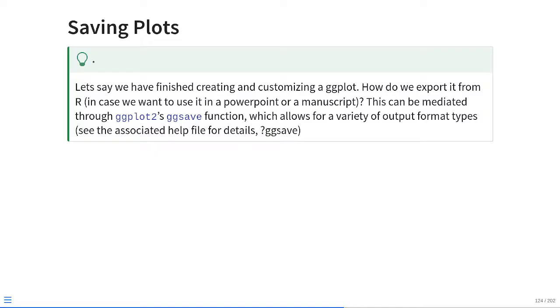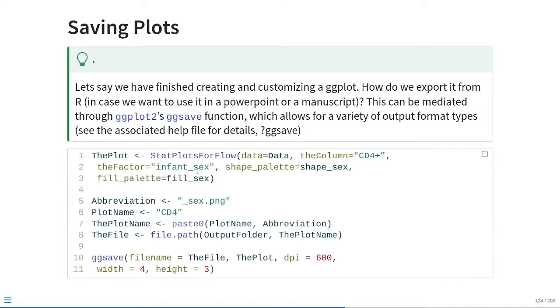And what this is going to look like in actual practice is something like this. So once we get back our plot that we're happy with, I'm doing a similar process to what we did when we were creating FCS files last time with downsampling. I am specifying a name that's being built out. Once this name is defined, I'm specifying a location I want it stored to and then placing it in which case I'm specifying the file type through the use of the .png.